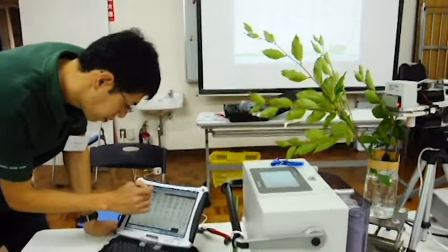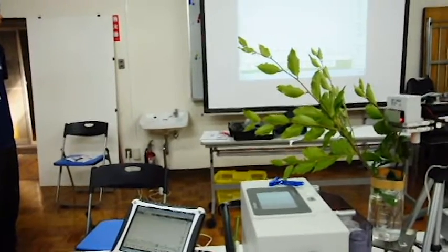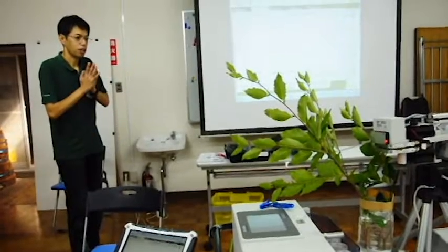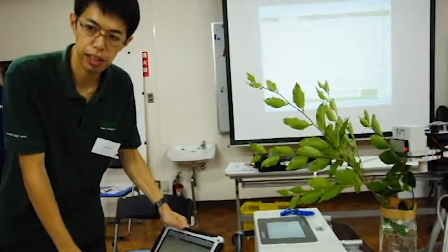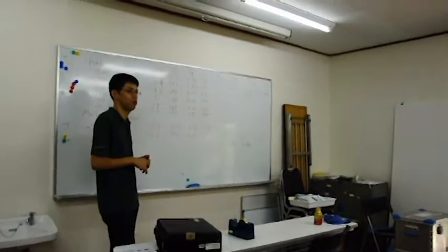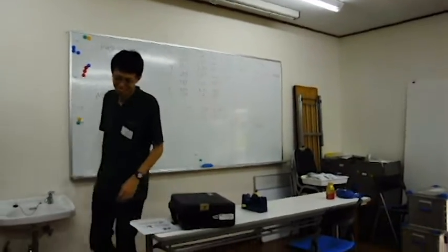Does the leaf wake up? It is increasing and increasing. Okay. We have to wait until this line is flat. So, I made a short, brief presentation about the gas exchange and the photosynthesis. And I hope you all wake up. Awake. Yeah. Okay.